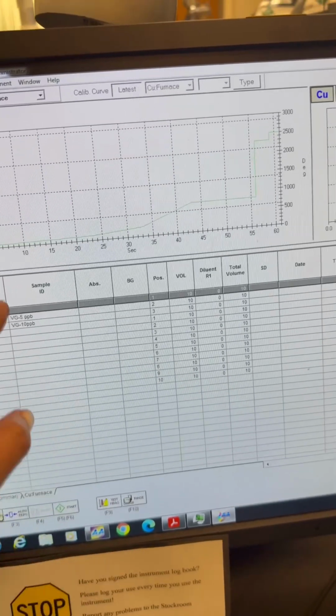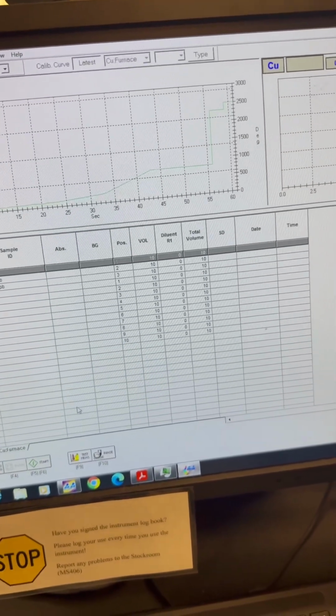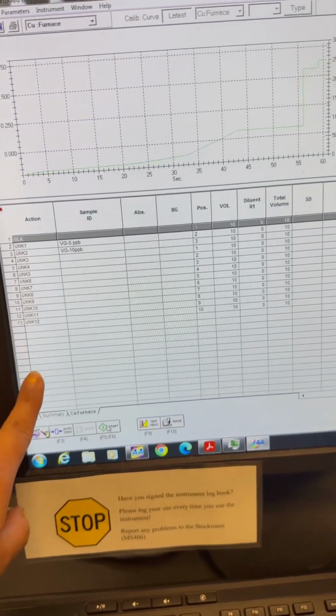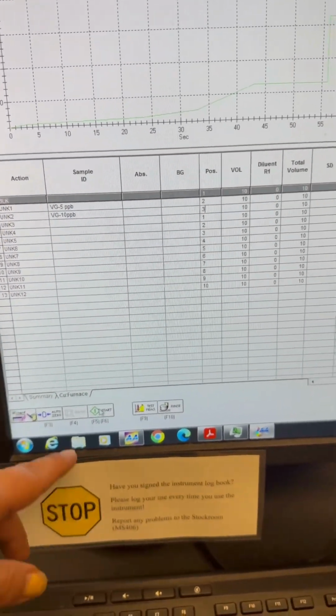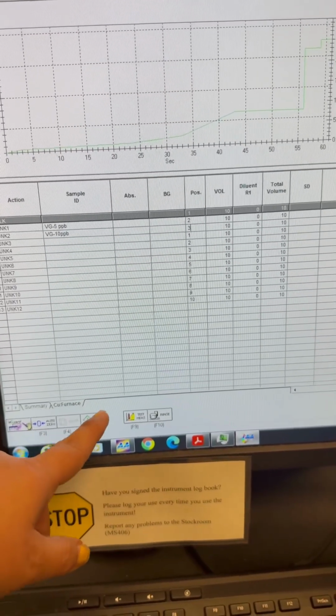Then after everyone is done for that day, at the end of the class or the lab, you're going to put them back to back, and I'm going to hit start here, and we're going to let it run. It should take 2-3 hours, so we don't wait for it.